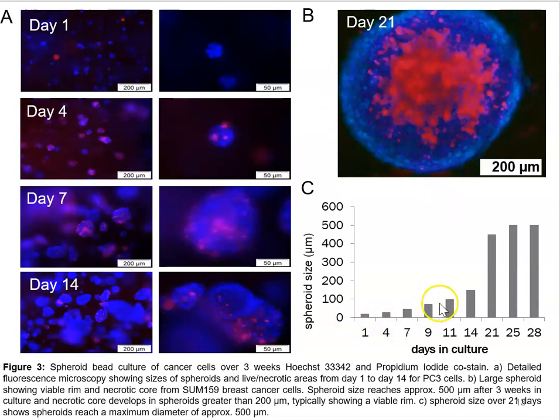And what we do is when we look at the size of these, we tend to get a plateauing at half a millimeter. That's as big as you can get these things to go, which for most applications is okay. For some applications it's not quite big enough.